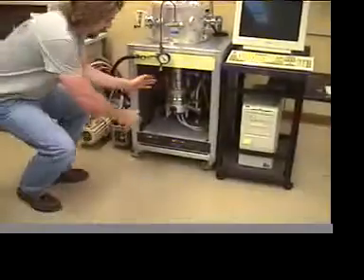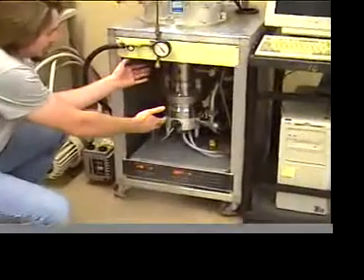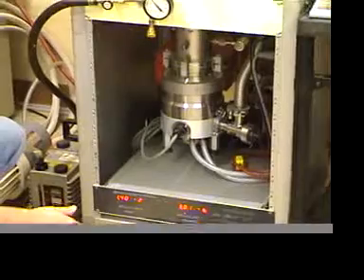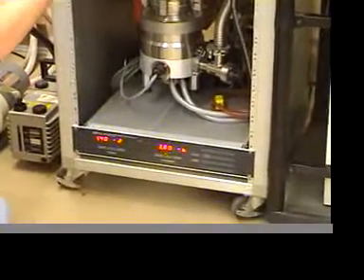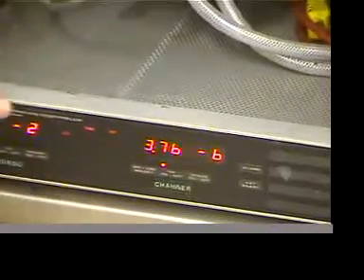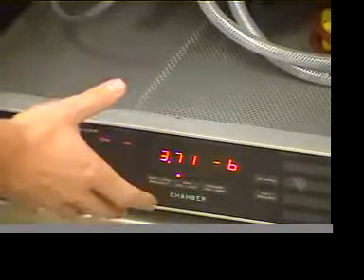and down here at the bottom, we have a turbo molecular pump, which maintains a vacuum inside the vacuum chamber. The ionization pressure gauge tells you what the pressure is inside the chamber, and all of this is controlled by the vacuum process controller, which you see right down here.